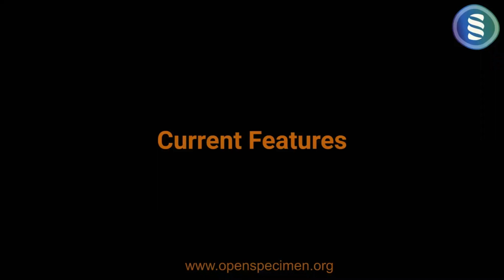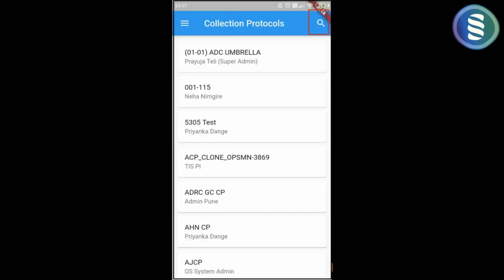What are the features that are available currently? So now I'll go through some of the screens in the mobile app. So you can add participants. First of all, you can see the list of protocols that you have access to, and you can search for protocols, etc.